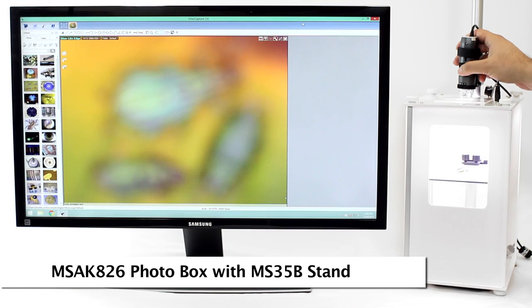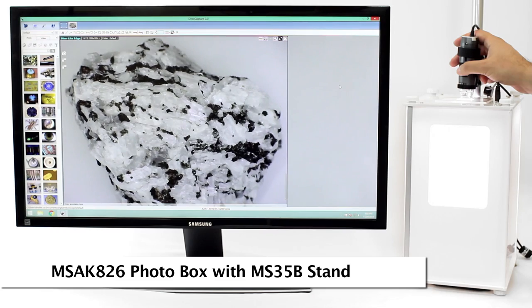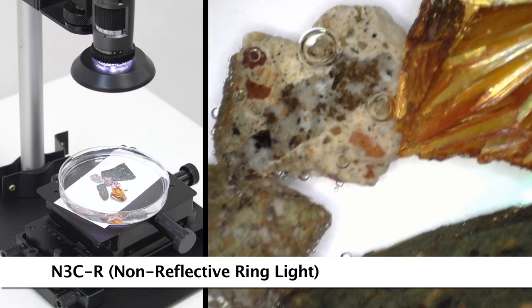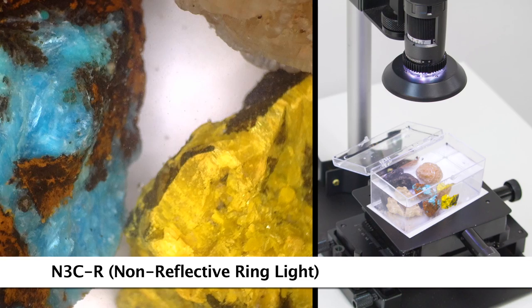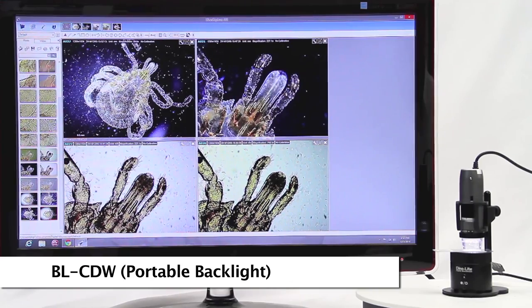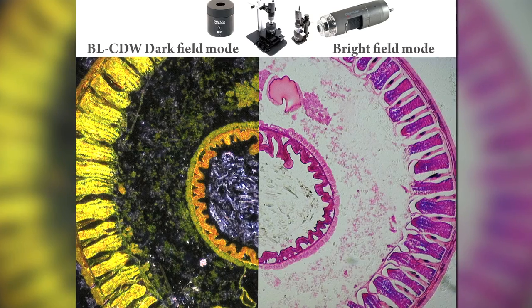The MSAK826 photo lightbox provides a controlled lighting environment for premium imaging results. Edge series models have various interchangeable caps including the N3CR ring light attachment, which uses the Dino-Lite built-on LEDs to shine light brightly and evenly. The BL-CDW provides a backlight stage with dark field and bright field illumination modes.